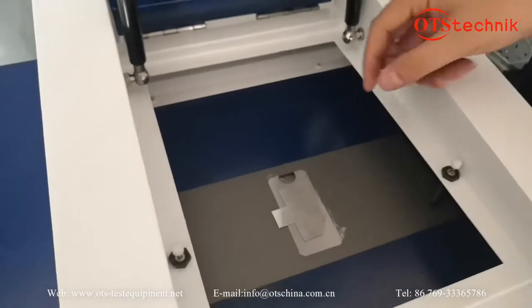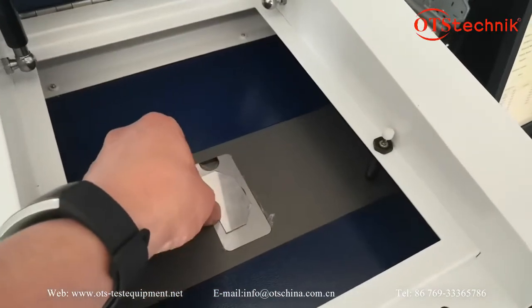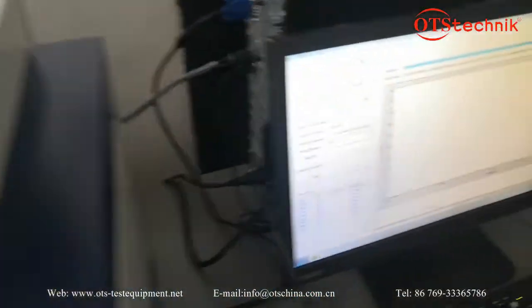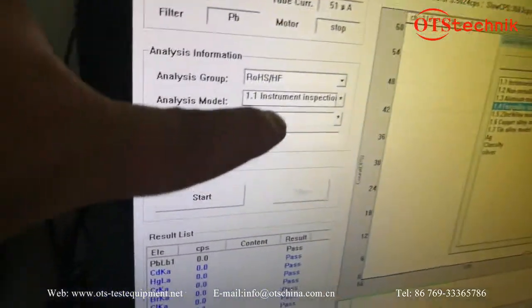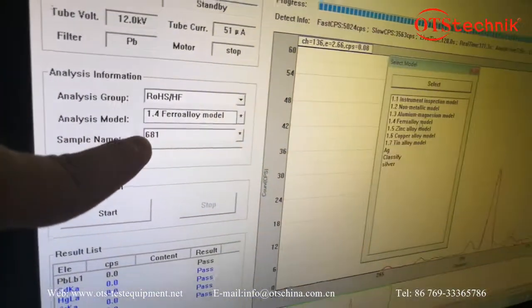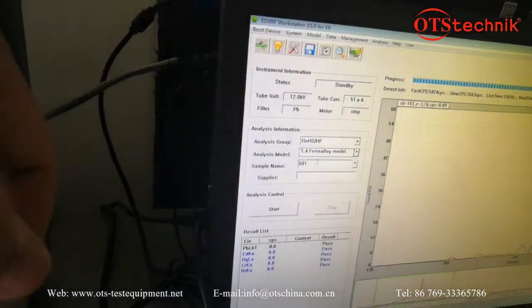Now let's do a test with this sample — stainless steel. Put the sample on the stage. We choose an analysis group; we choose RoHS. And for the model, we choose this one because stainless steel belongs to this model.